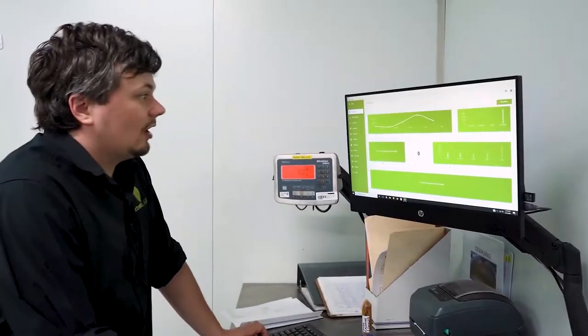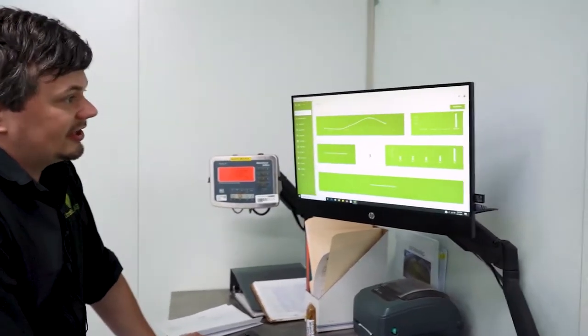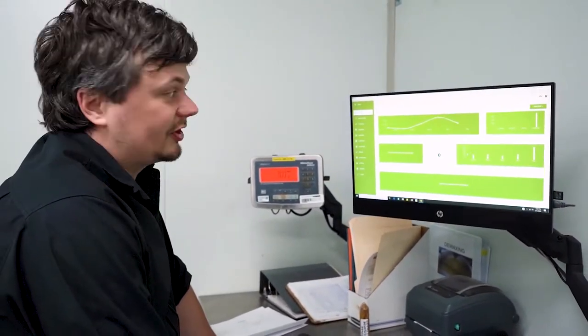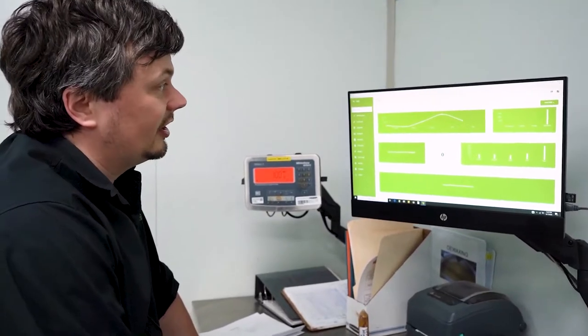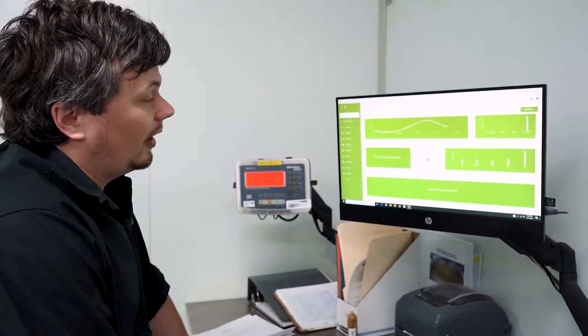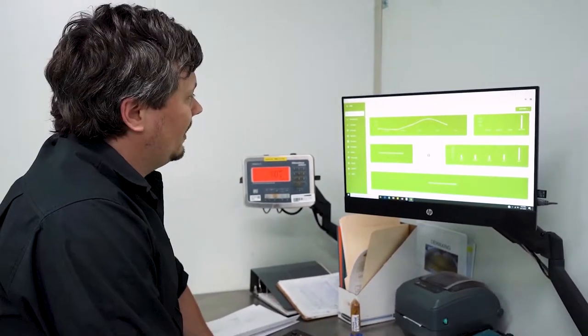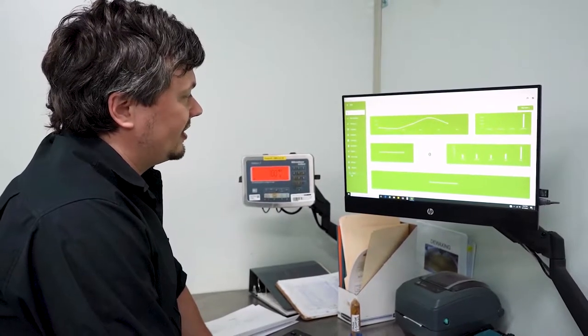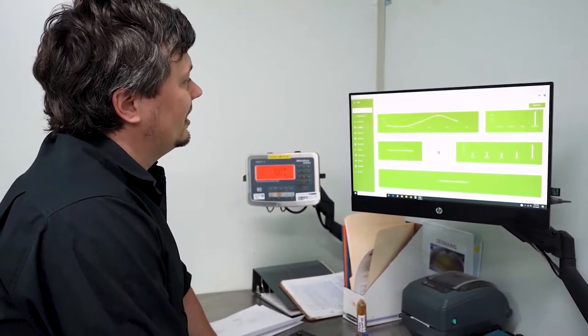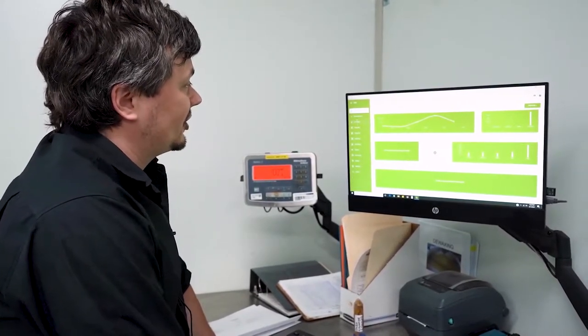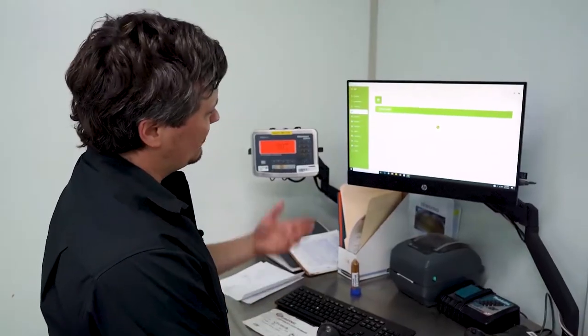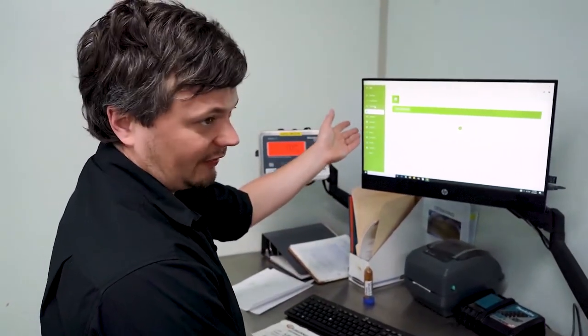So I can log into IGW. Here's a dashboard, which provides just at a glance, some interesting information for managers. Along the left-hand side, there is basic ubiquitous functions, such as a barcode check. There's some other functions, such as a log waste function.